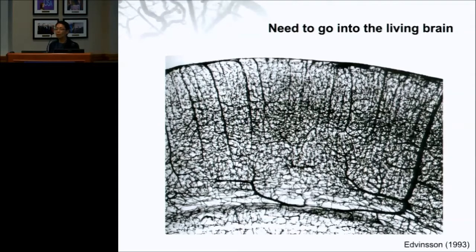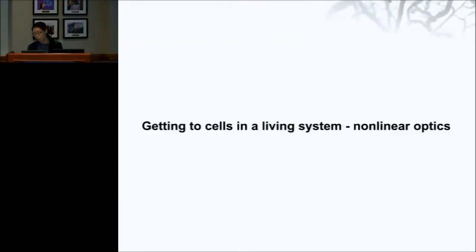But one of the things that is a big challenge is that we really need to understand what's going on, not just at the very surface, but down in the depths of the tissue. So the way we dealt with that, and the way we get to being able to study the cells in a living system, is through nonlinear optics.